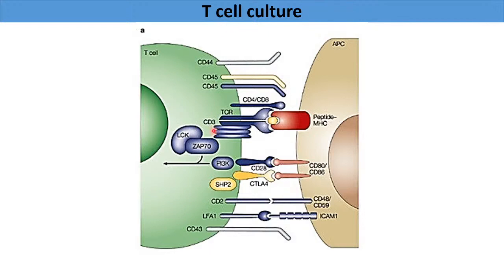I can take the T cells which I have purified and I will mix them with antigen presenting cells which are loaded with what? Antigen. Okay, in 1:1 ratio. And if I am doing that, my T cells will get all the signals. I will add some IL-2 in the media for activation and the T cells will be happily growing. Good method, easy to do.